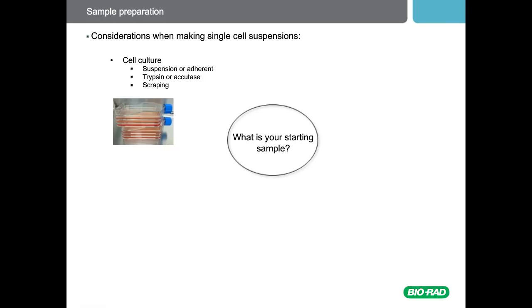Some cells, such as primary macrophages and dendritic cells, are often harvested by scraping to try and be as gentle as possible. However, whatever method you choose, there will always be a loss of cells and dead cells present.